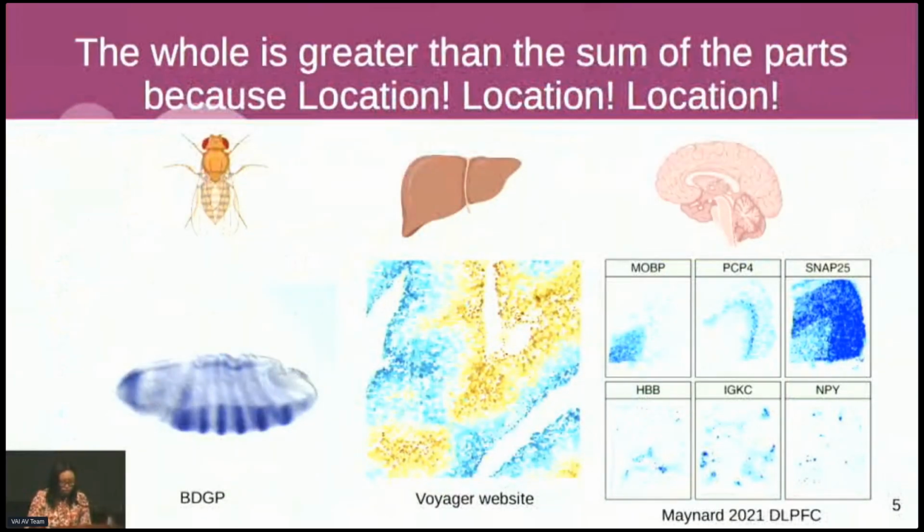In histological space, the spatial distribution of gene expression in different cell types is also very important to the proper function of the tissue. Just like in geographical space, by having spatial information we can ask many questions: which genes have spatially structured expression patterns, which genes co-express in space, what are the archetypal expression patterns, what are the spatial regions, and so on.